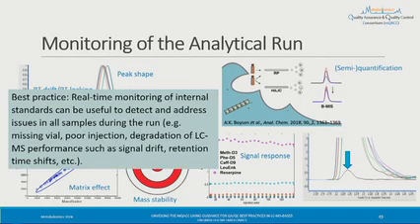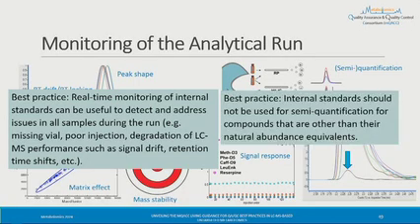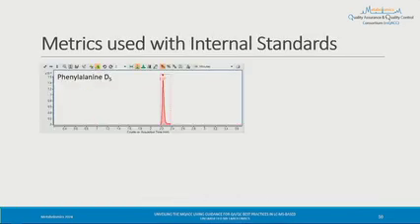So then in terms of best practices, this is where the real-time monitoring practice comes in. If you can monitor during the run, it can help you address problems as they occur. And this also leads to the recommendation that we don't recommend their use for semi-quantification unless they are correlating with an analyte of the interest.